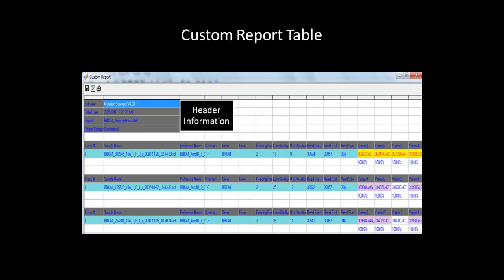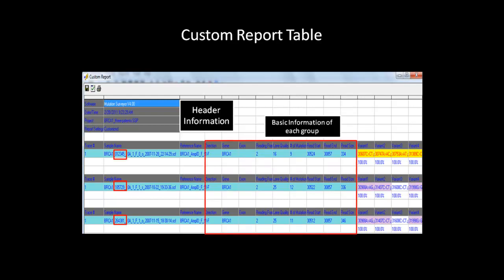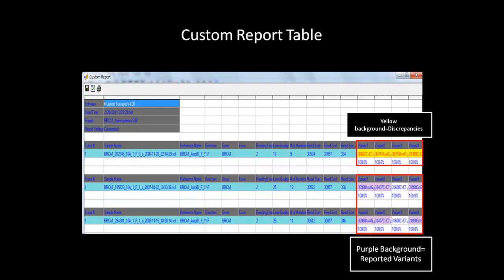The report will generate with a header. In mutation surveyor, you can create your own header in the custom report. In this table, you can see that there are a total of three consensus groups for the three individual patients grouped by their patient IDs. All basic information such as start and end position, size, quality, and other data are displayed in this region. Any variations with a yellow background indicate discrepancy, as the mutation is only present in some samples and not all, and suggest that you review the variation manually. By double-clicking on the mutation, you will be taken to the mutation position in the main analysis window for review.